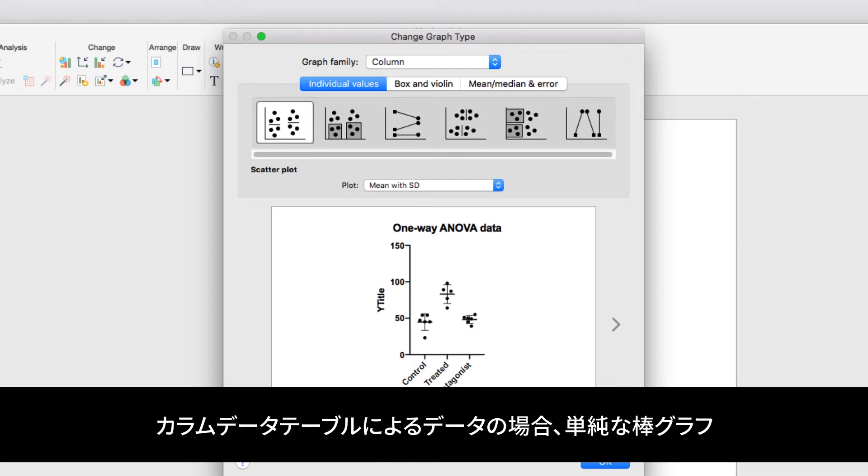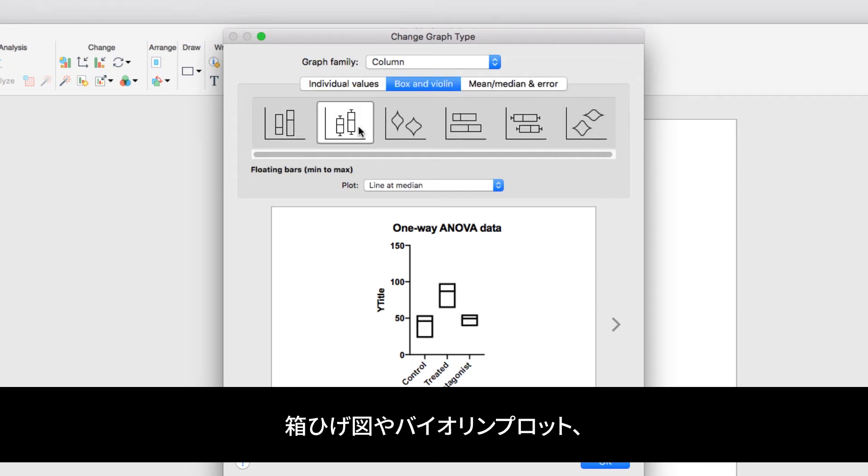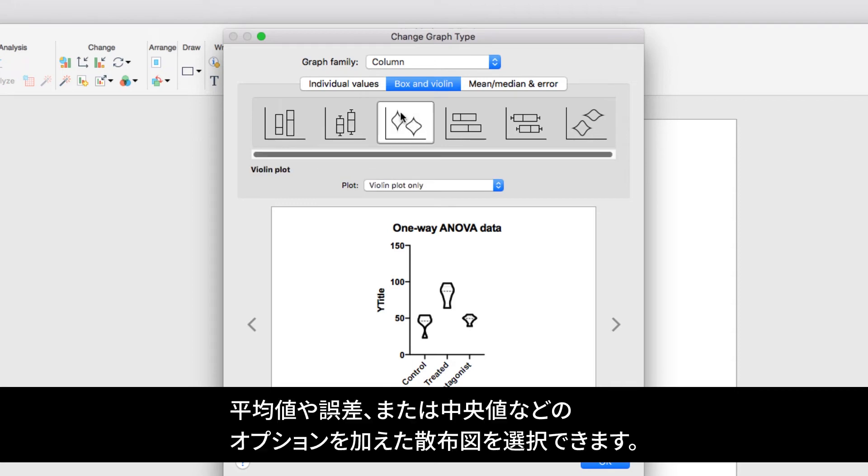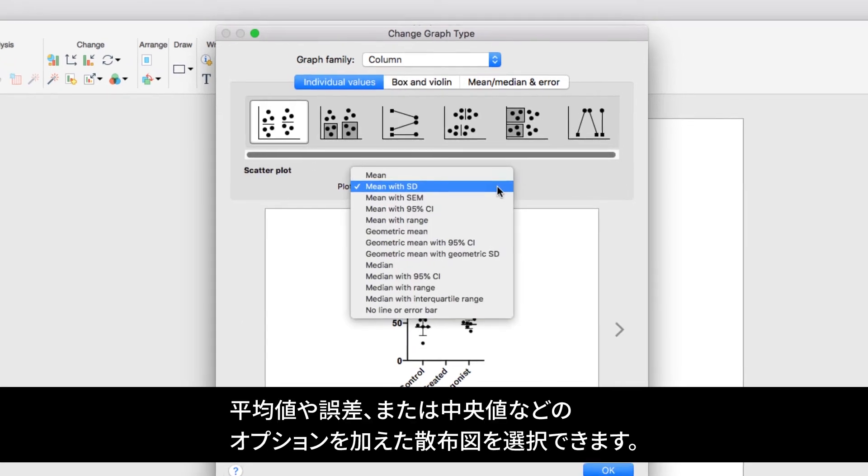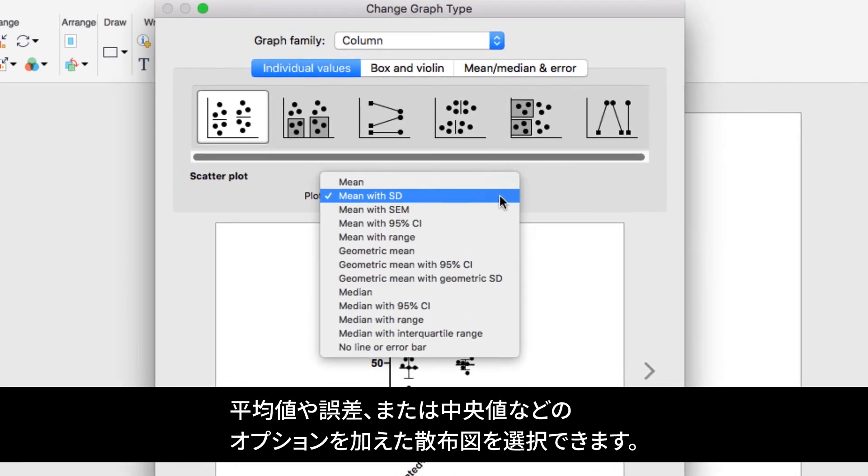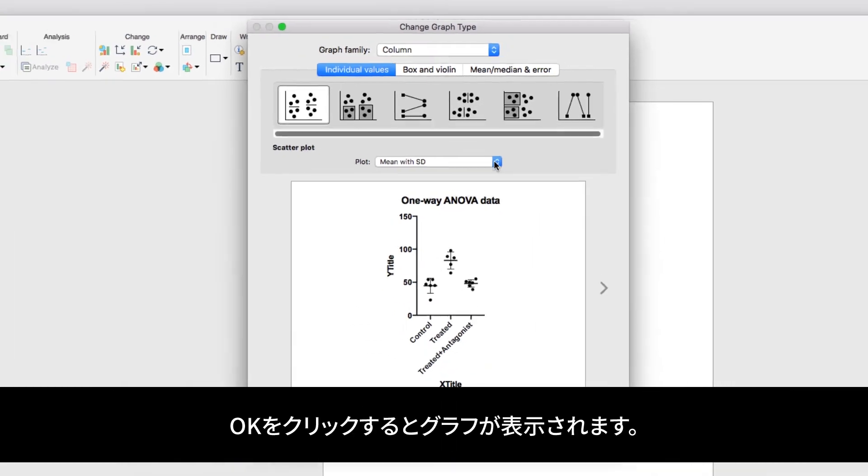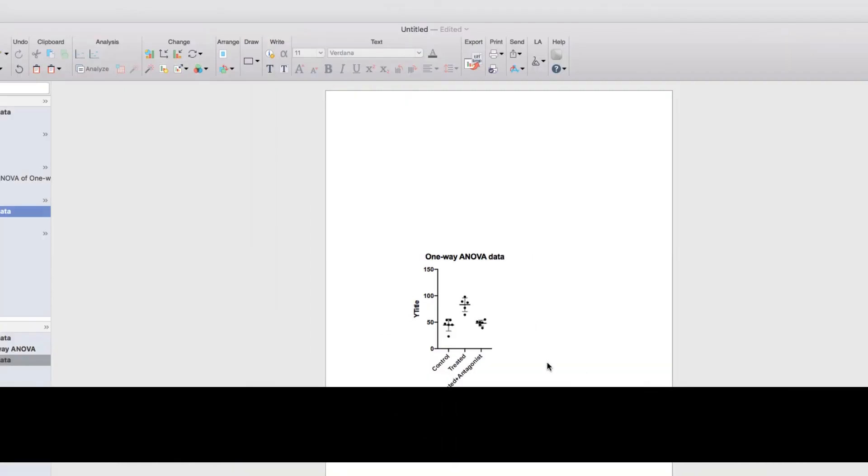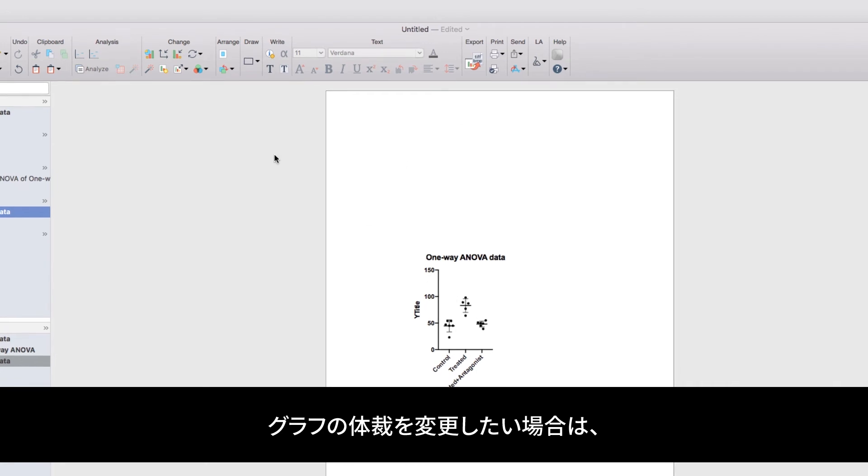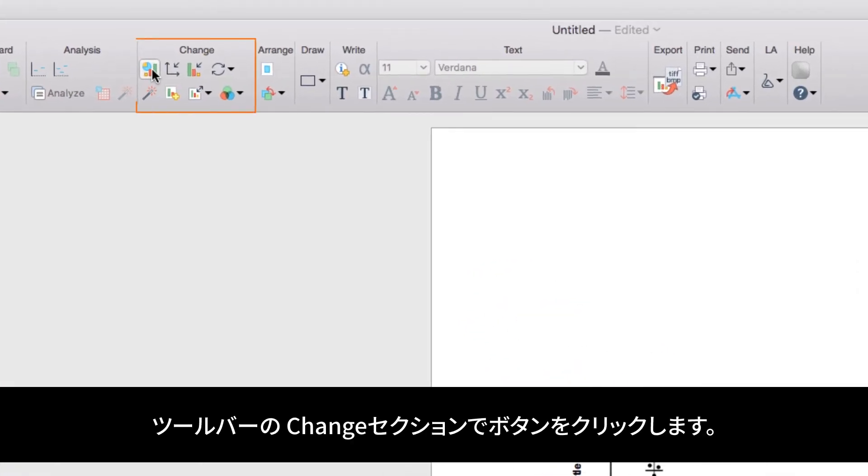For our data that come from a column data table, we can choose to show our data as a simple bar chart, as a box and whisker chart, or a violin plot, or simply as a scatter plot with various options for how to show the mean and error or median and error as you choose. When you click OK, your graph will be shown. However, if you change your mind later, you can always go back to the Change Graph dialog by clicking the button in the Change section of the toolbar.